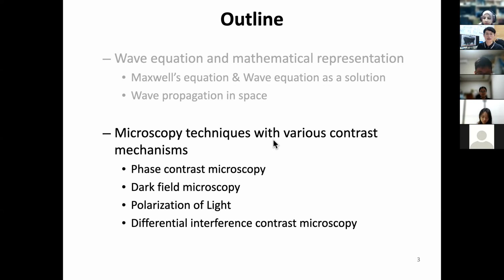So that way, I think it's worthwhile to cover phase contrast microscopy, dark field microscopy, and for understanding this further, there's a type of microscope contrast mechanism based on polarization. So we will talk a little bit, and then DIC, which is also well commercialized, and you can find it in many of the cell-dealing laboratories, so-called DIC, or differential interference contrast microscopy.